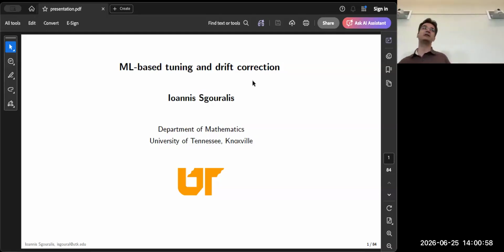So basically imagine that as how we can start thinking and developing algorithms and deploy them in real time, so that they will instruct the microscope to correct itself while we are acquiring the images. We have already seen some examples in the previous talk. So the main topic I will be talking about is how we actually start thinking about putting together the machinery that needs to go into our scripts that make drift correction possible.